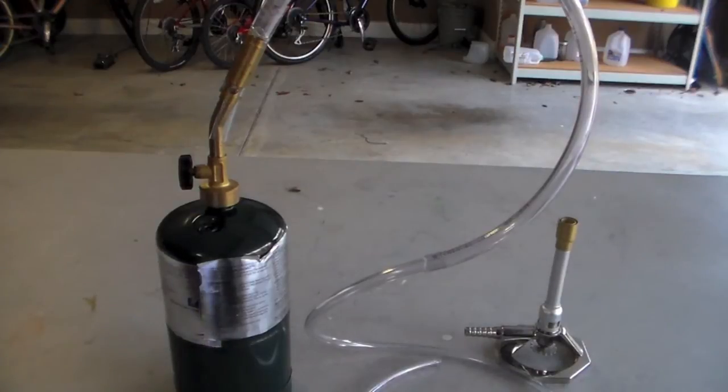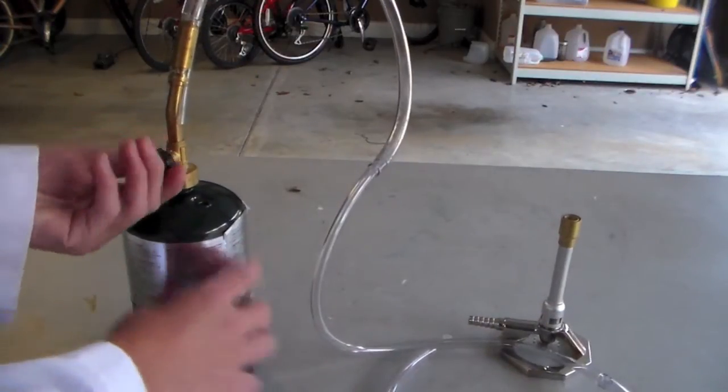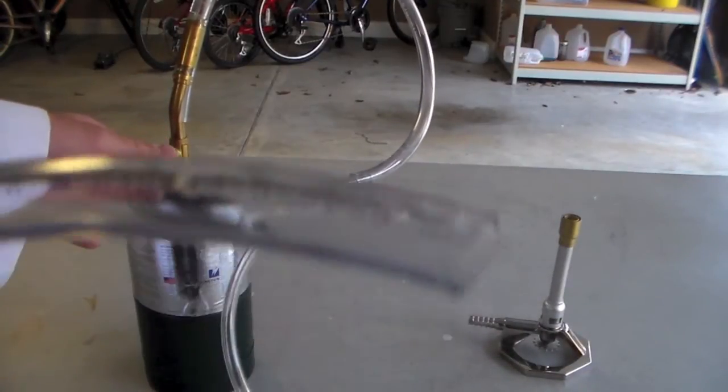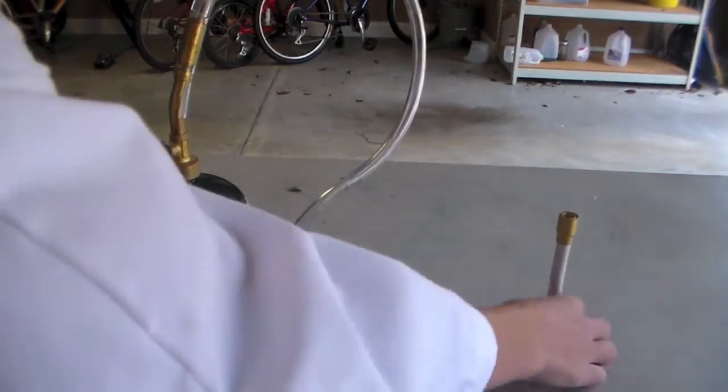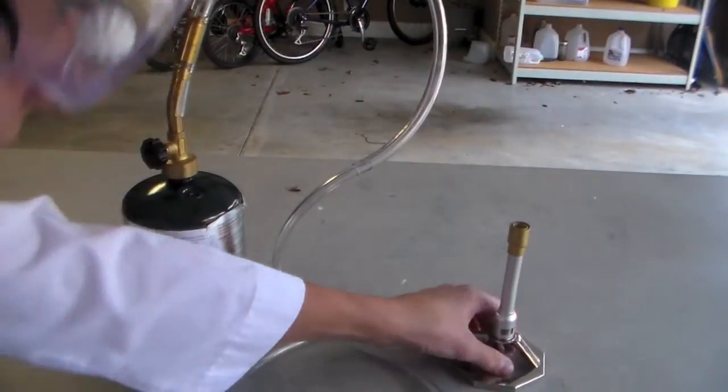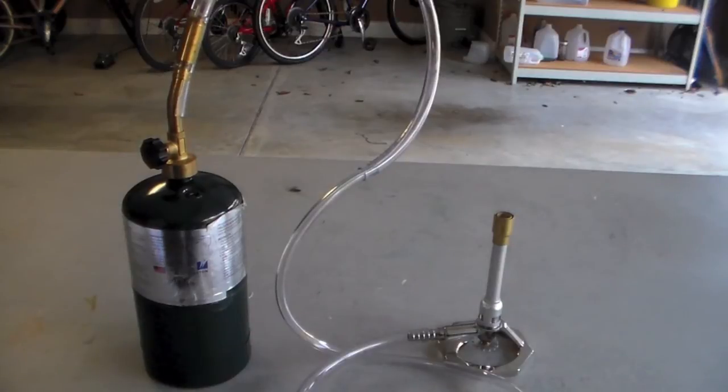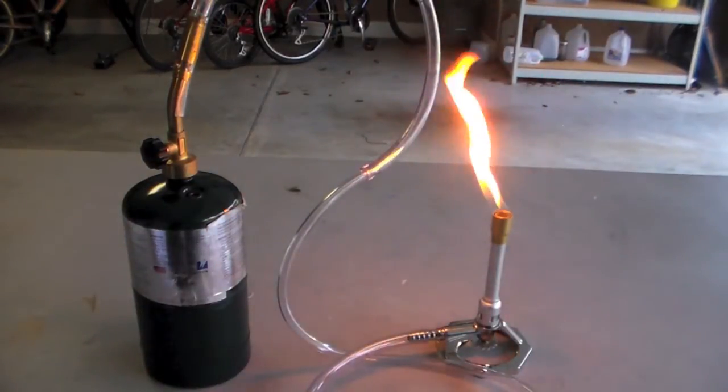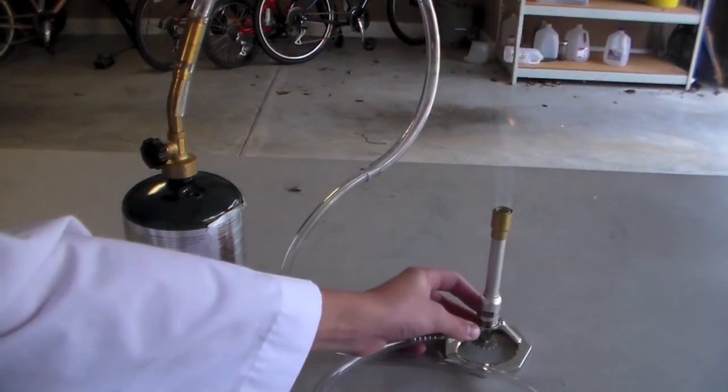Alright, so time to show this in action. So I'm going to turn on the gas and I'm just going to hold it up so you can hear the gas coming out. Now I'm going to connect it to the burner and set everything and light it with the flint striker. And you can see it lights right up and it can be adjusted just like a normal burner.